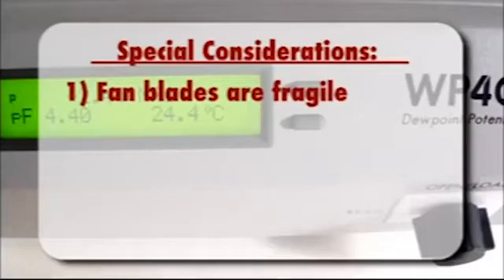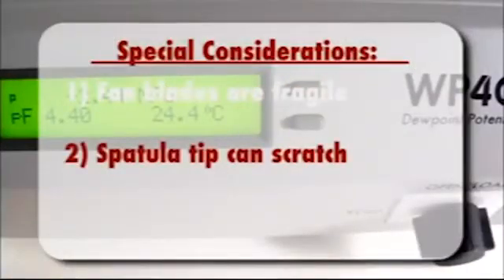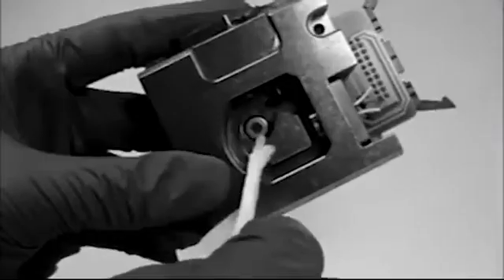Some special considerations include the fan while you're working inside the sample chamber. The fan blades are very fragile. You may want to just remove the fan before cleaning, as long as you remember to replace it when you're finished. Don't let the plastic spatula scrape the sensors or the mirror.